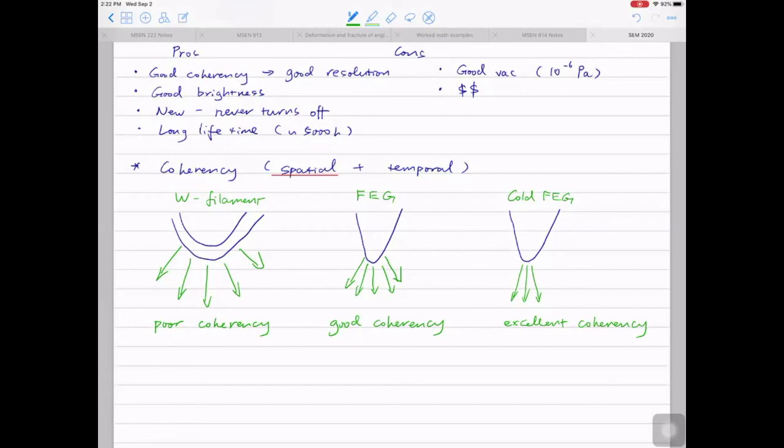The SEM we use nowadays, the spot size is not an issue. But in many of the cases, in about 3-4 weeks, when we learn about the electron beam material interaction, you can make the beam super fine, but the signal you generate is over a volume underneath the beam. So the interaction volume is way bigger than the beam size.